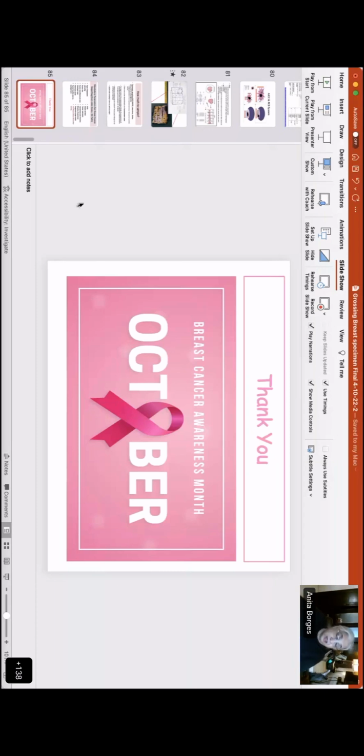Because if they haven't done it in the operating room and they want to reconstruct the breast later, then they need to know how much skin has been lost and the weight of the mastectomy, so that they can use a suitable implant. Anybody who's a breast surgeon does this automatically in the operating room. It's documentation for us, but for the surgeons it is about how they plan the reconstruction, either later or at the same time.